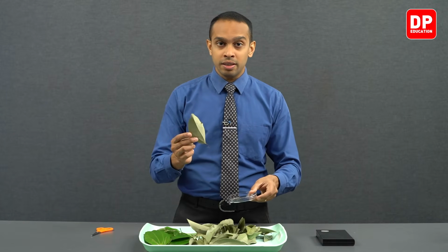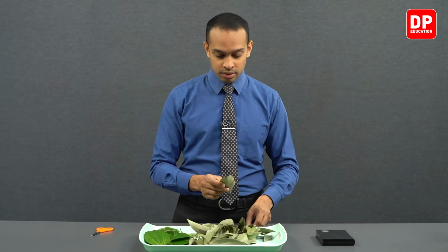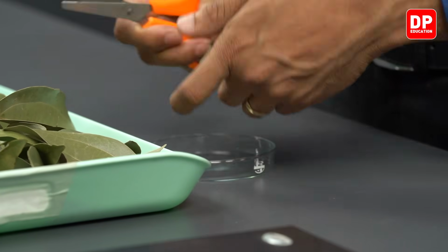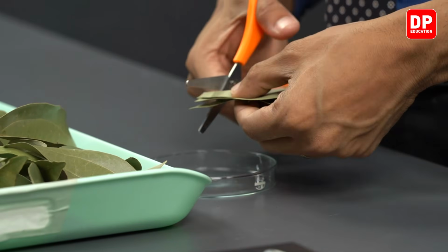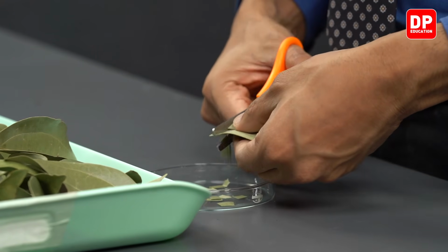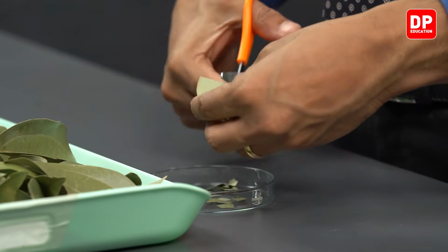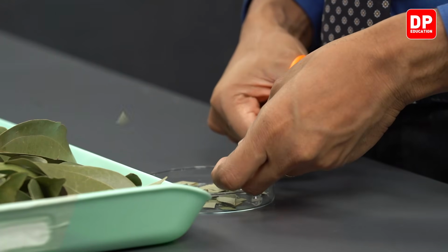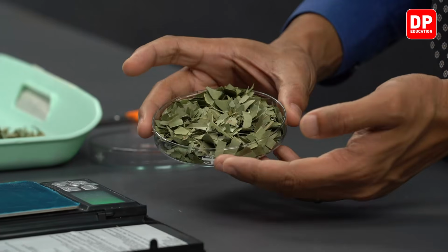So let's first cut these cinnamon leaves into small pieces. We will be adding the cut pieces into a petri dish. It's better if you can cut them into small pieces. Now students, we have cut a few leaves into very small pieces here, as you can see.